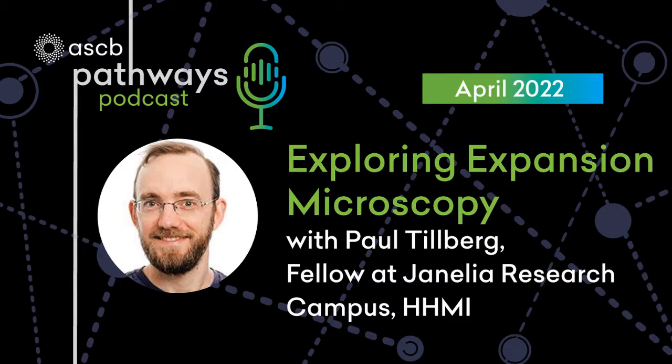this cool ultrastructure from EM. We know that these proteins are involved somehow from other methods. And with expansion plus SIM, they were able to see how these proteins are actually distributed in this known ultrastructure. So that's an example of, I think, a very cool use for it.